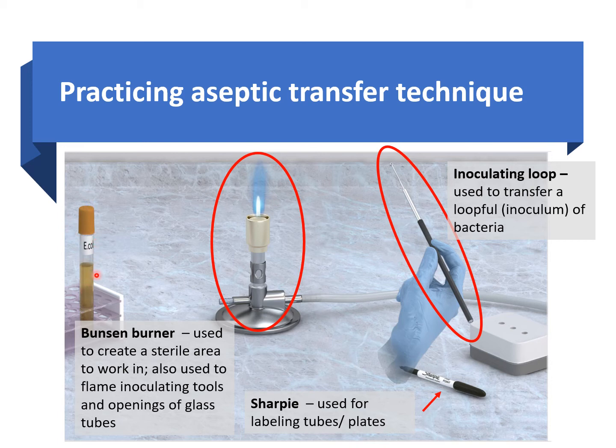Now, when you open up that tube, make sure again that you are pretty close to the sterilized zone. When you uncap that tube, never place the tube on the surface. Otherwise, you're going to contaminate it. So when you uncap it, hold on to that cap in between your fingers.